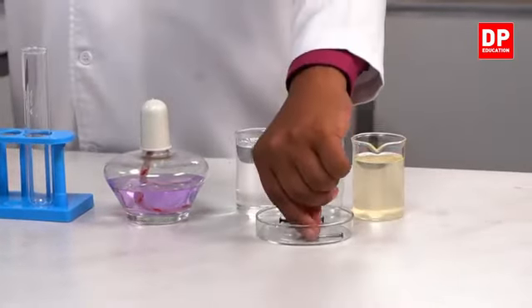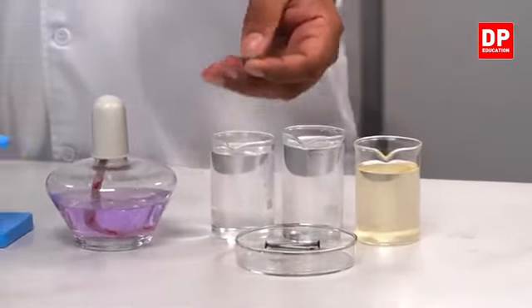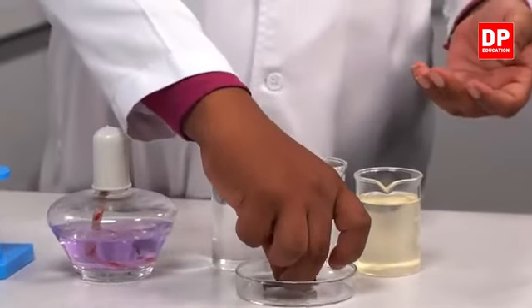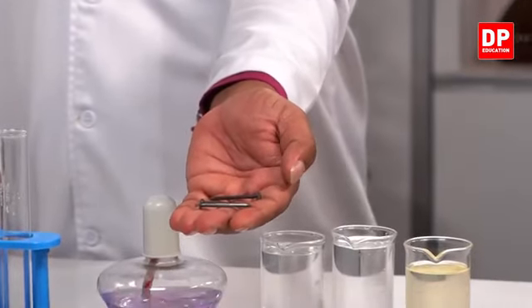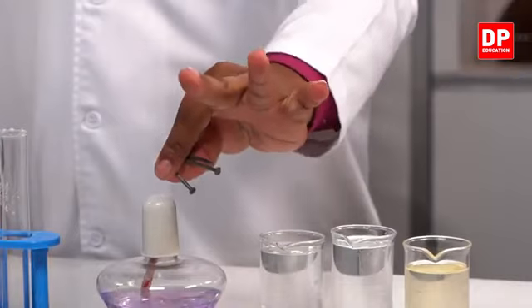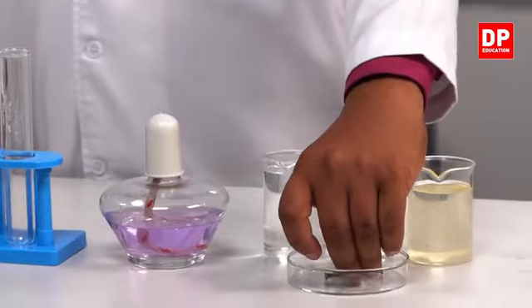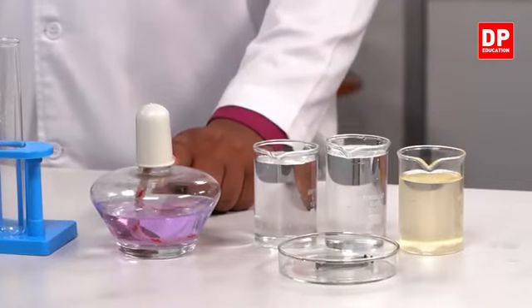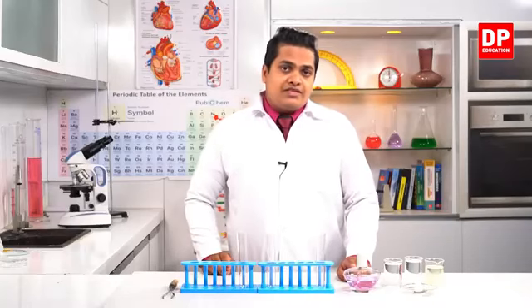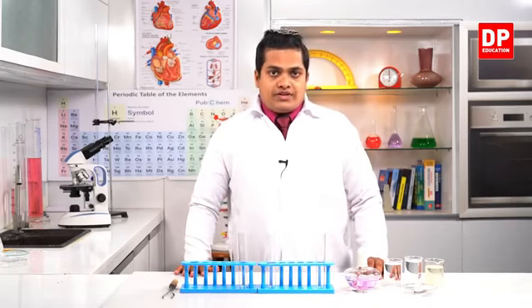And some cleaned iron nails. Here you can observe there is no rust in these iron nails. I have 3 iron nails, separately for each boiling tube. These are very clean and there is no rust at all. See, you can observe it. And I have a spirit lamp here with me. I'm using this spirit lamp to boil water. So let's see how to conduct the activity.